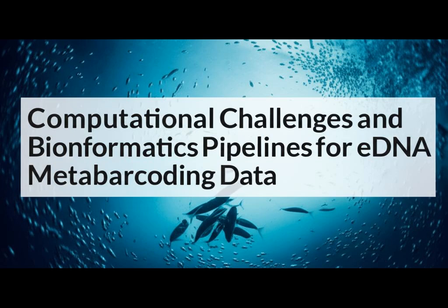Distinguishing real DNA from errors introduced during the process also remains a challenge, though denoising helps a lot. And comparing results between different studies can be tricky due to variations in lab and bioinformatics methods, but the field is moving fast. We're seeing better algorithms, more use of cloud computing making analysis more accessible, and user-friendly pipeline tools being developed. There is a big push to improve reference databases and standardize protocols. Machine learning is also starting to play a role.